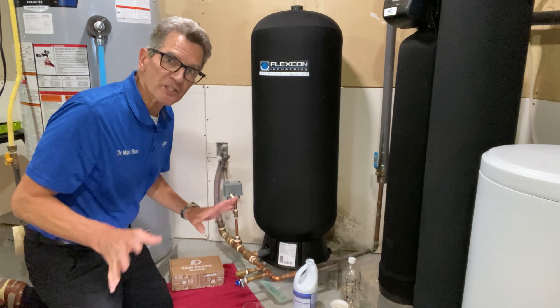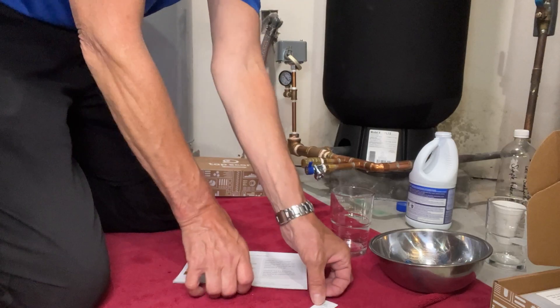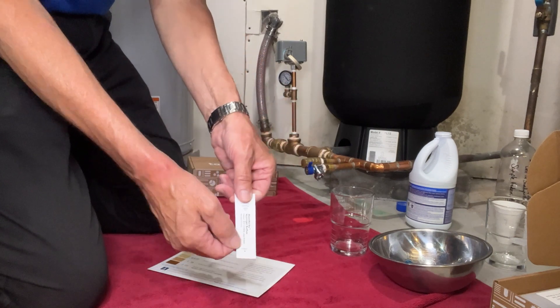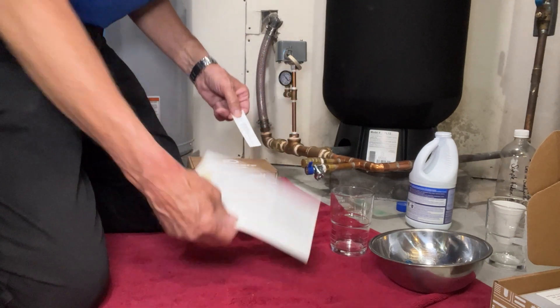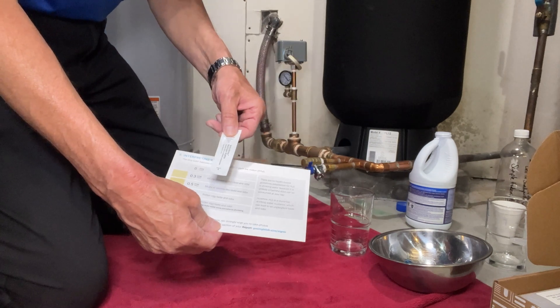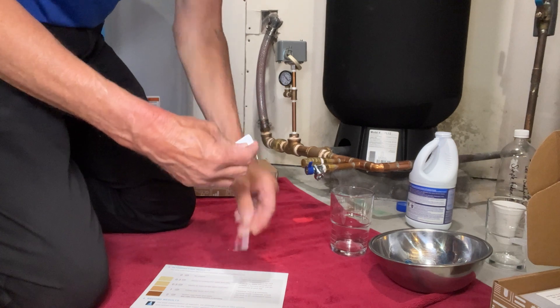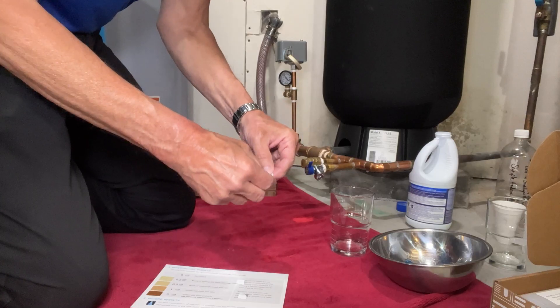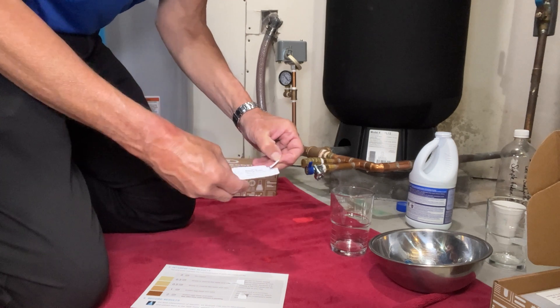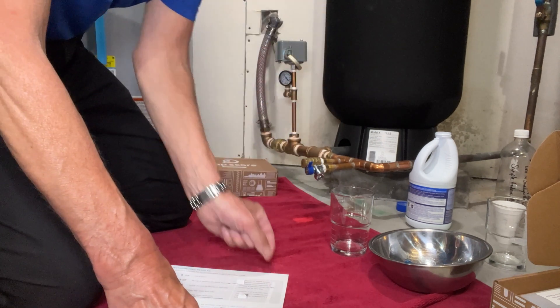The hydrogen sulfide test includes two parts: a strip that you dip into the water, and a chart that you use to compare the result. Open up the packaging, tear it off, and get the strip out. Again, you don't want to touch the strip — set it aside for a moment while you prepare the water sample.